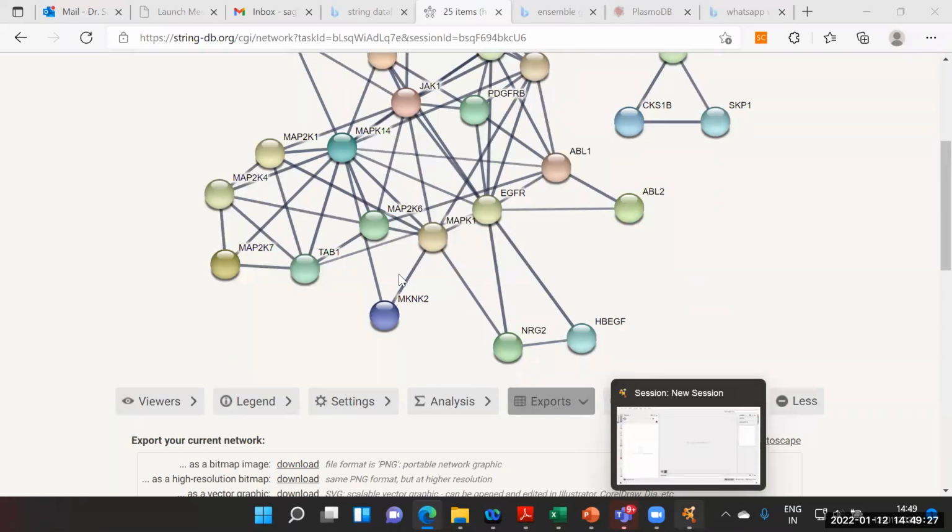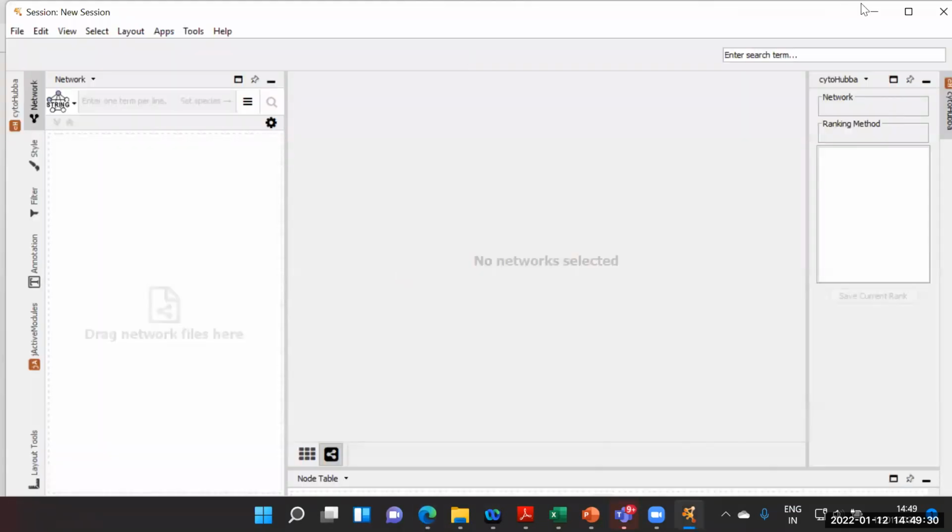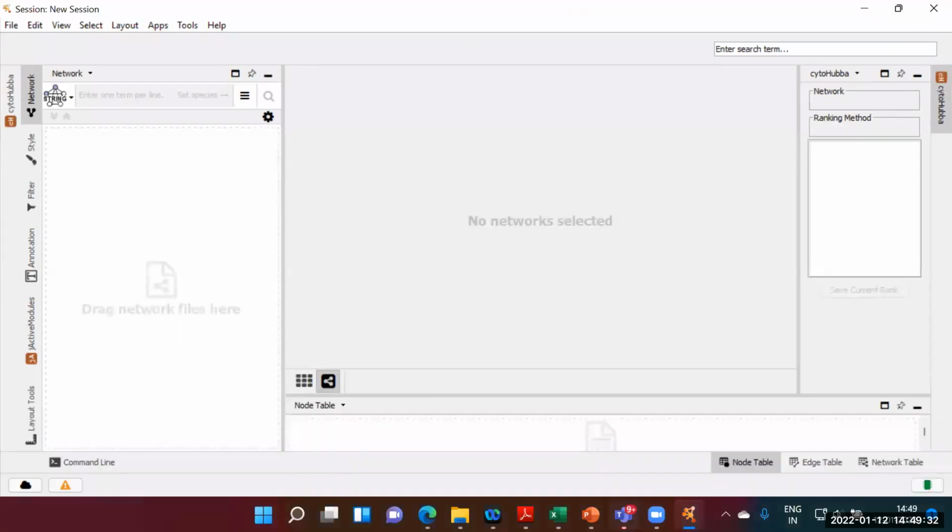First, I will talk about Cytoscape. Is Cytoscape visible to you all? Visible to all? You can simply raise your hand. Okay. So this is freeware which is available, and you can download it on your PC, and network-related or some other features are also there, and additional tools which are required.